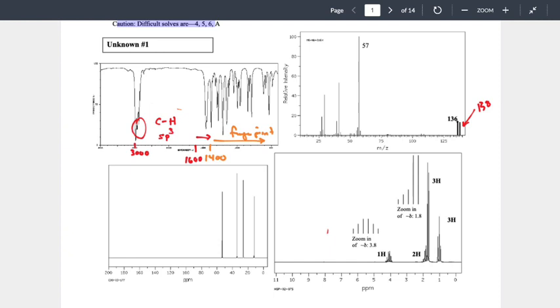Okay, halfway there. We got two forms of spectroscopy left. We've got our carbon NMR and our H NMR. How do we know we're looking at carbon versus hydrogen? There's a couple cheats. Sometimes the H says HNMR on it, or says an H. That's a big tip-off.